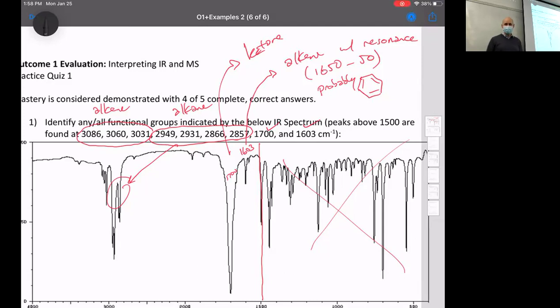So there are a lot of peaks labeled here. There are 9 different peaks labeled, but I wouldn't try to label every single one of these. Start over here and work your way to the left. What you'll find is the stuff on the left most of the time doesn't bring you anything brand new, or at least a lot of times it doesn't. So you can just hand wave all of these things and say, oh, those are just alkane. And oh, those are alkene, but I already knew that. So it's not new information. That's it. I did one for you.